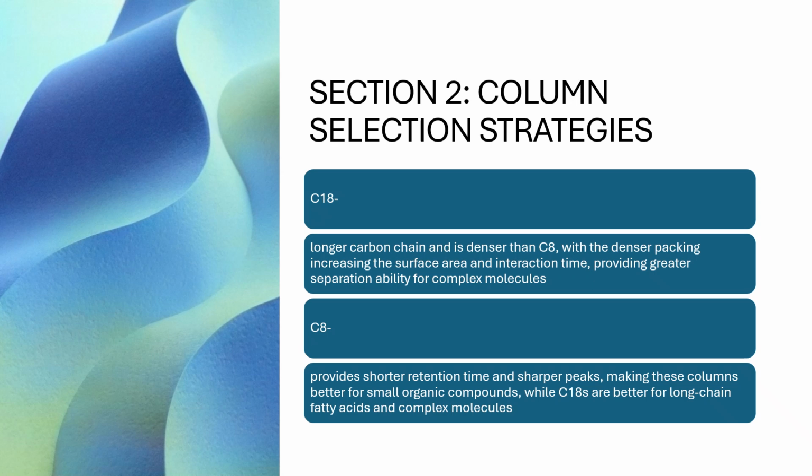For most applications, start with C18 columns. C18 has longer carbon chains and is denser than C8. The denser packing increases the surface area and interaction time, providing greater separation ability for complex molecules.